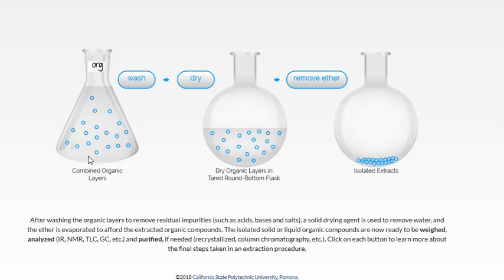After letting the drying agent sit for a bit, filter it off into a tared round-bottom flask — pre-weighed before adding the solution. Then remove the ether by distillation or, if you have a rotavap, quickly remove the volatile solvent under reduced pressure. That gives us our isolated product, and we can immediately weigh the flask to know how much compound we have isolated.